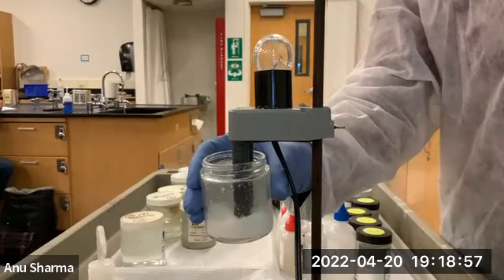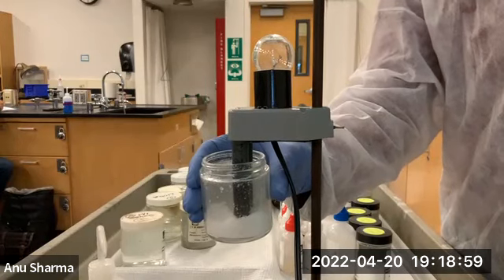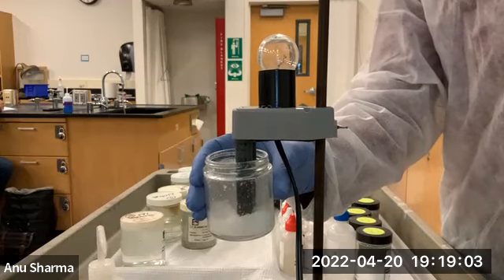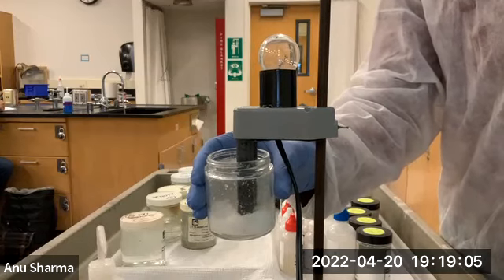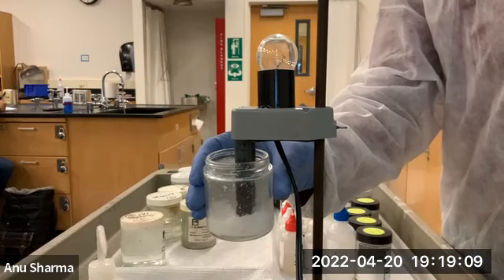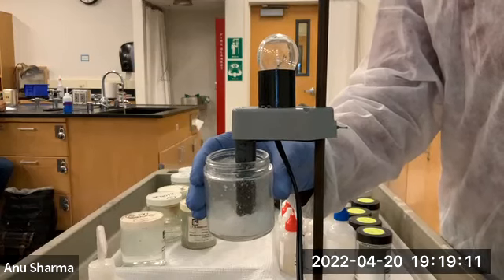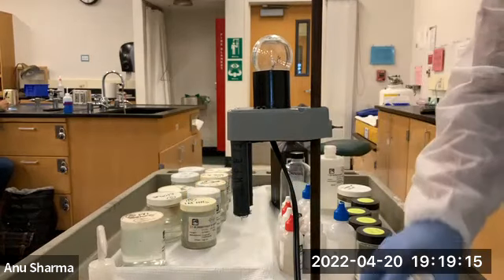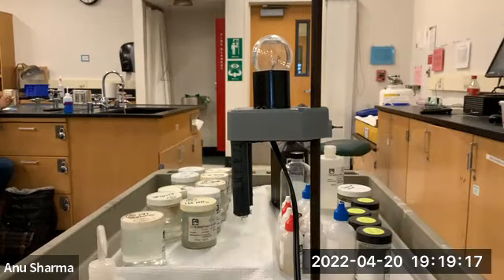Remember that sucrose contains lots of carbons and hydrogens, so it's a covalent molecule. It contains OH groups, but they are also covalently bonded, not available as ions. But they will form hydrogen bonding with water. So here you write non-electrolyte in solid form, and the major species is the full molecule, C12H22O11.